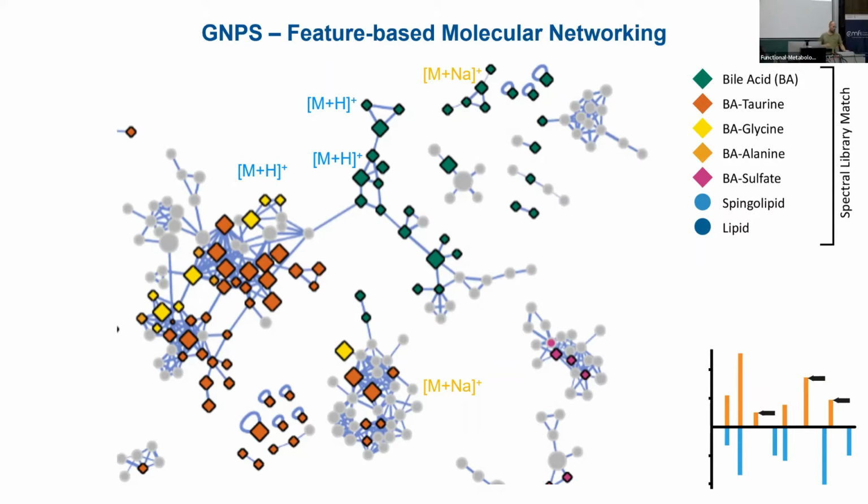I would also like to stress that okay, we only see different adducts here, right? But you should also be cautious that you can also have in-source fragmentation. So I know someone who was always looking for fragile molecules, but then the in-source conditions like the drying gas and the declustering potential, everything was set too high. And so she was always losing her glucose or whatever was on there. And even for the bile acids, we can see that free bile acids tend to have very intense, even more abundant M minus water. So they have water losses because of all the hydroxy groups in the aliphatic system.